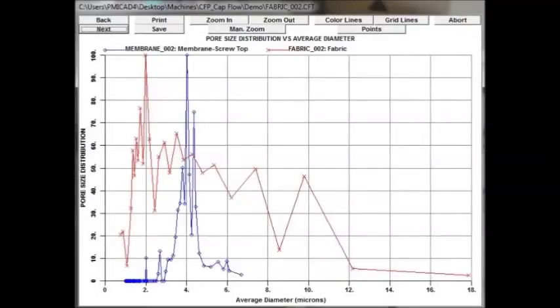Having the line plots for each histogram plotted instead of the histograms on top of each other makes it a little bit easier to read. Here you can see the 2 different distributions for the samples, again with membranes being the blue lines having a much tighter distribution, as the pores are track etched, made to be in a small pore size range on the material.